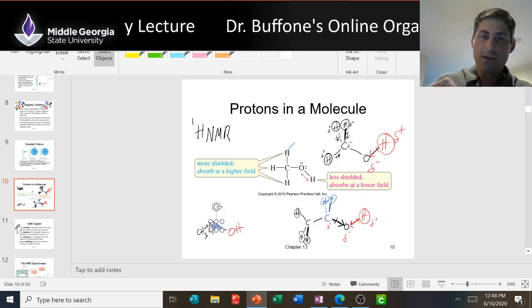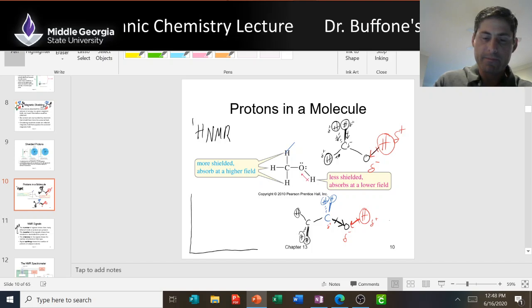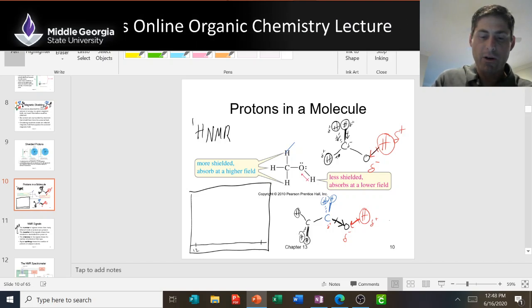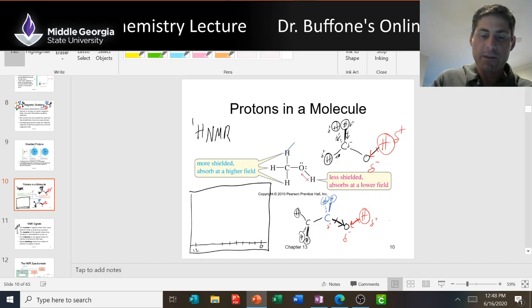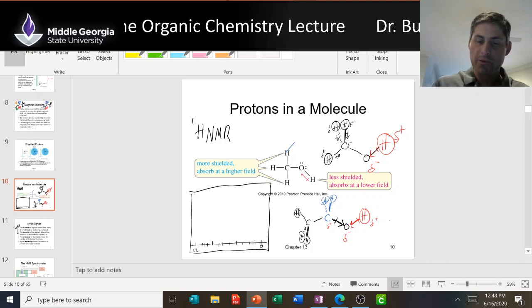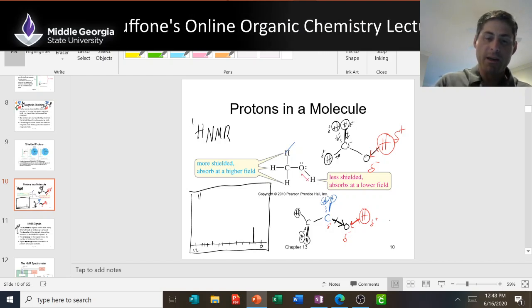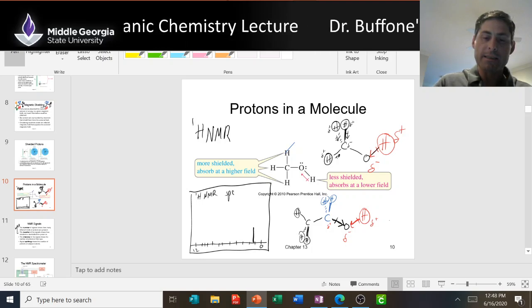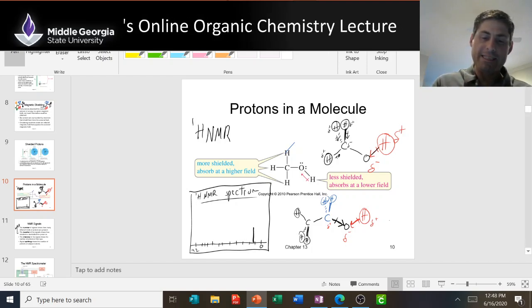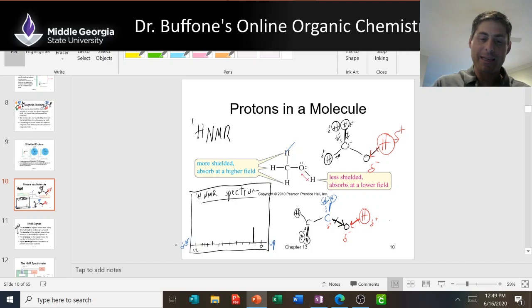So check it out. If I have a proton NMR spectrum, this is going to be my little page, and I'm going to have a scale here, 0 to about 12. 0, 1, 2, 3, 4, 5, 6, 7, 8, 9, 10, 11, 12. You're going to get different signals. I'm going to get a signal for this guy, close to 1. I'm going to just put a line where my signal shows up in the proton NMR spectrum. Okay? Then the blue is going to be a little bit more de-shielded, so it'll be downfield. So downfield, upfield. More shielded upfield, less shielded downfield.